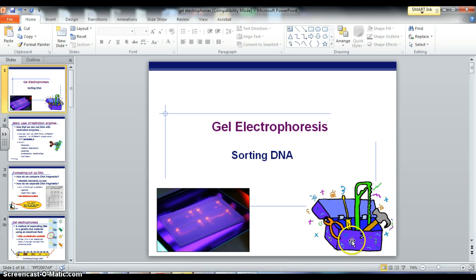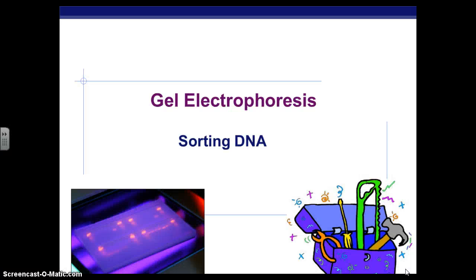Okay, so today we're going to learn, or for some of you on Tuesday, depending upon if you're staying after school, today we're going to learn about gel electrophoresis. And the purpose of gel electrophoresis is that it allows us to sort or visualize DNA.